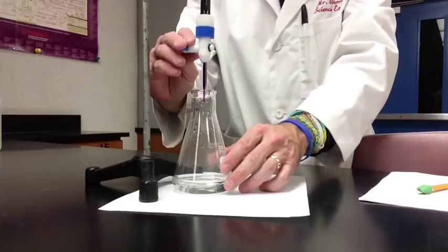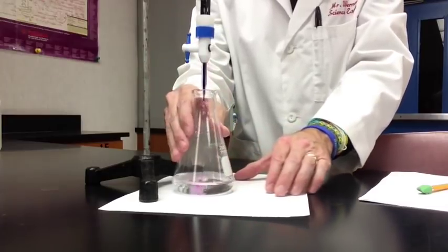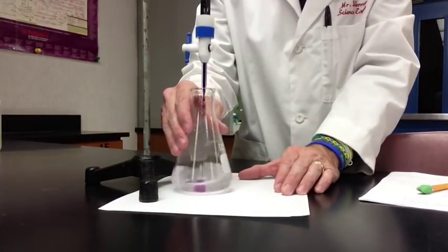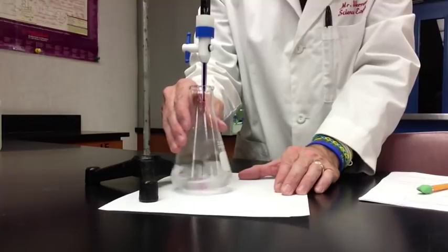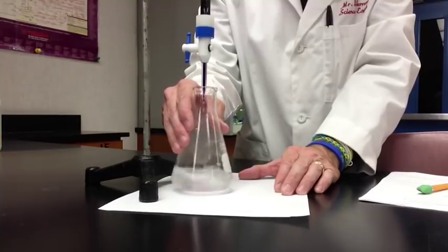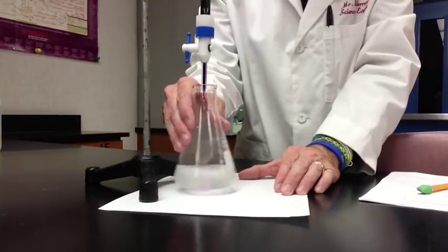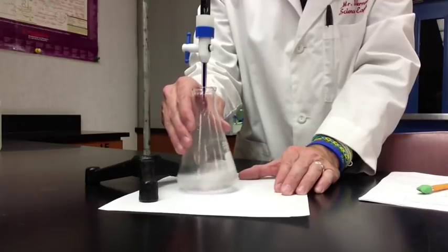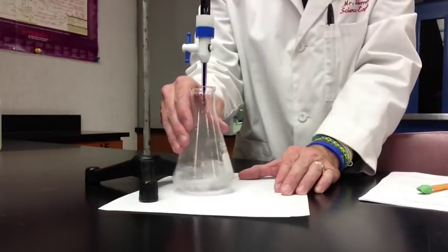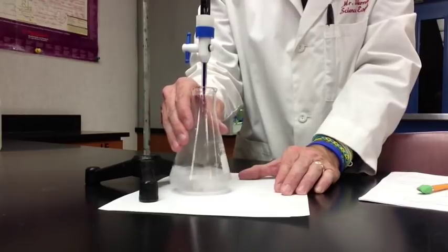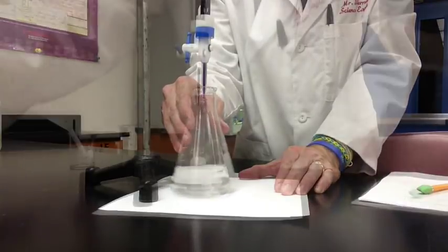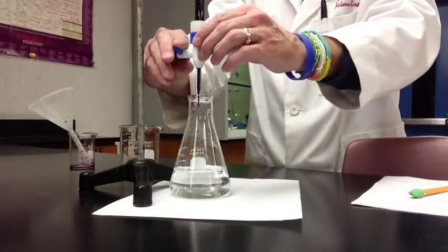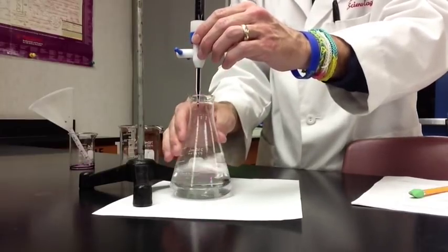Now you could have it already set at whatever measurement. It could be at the zero or whatever your starting measurement is, make sure you record that. Then you open up and you can let it stream for a little while because it's going to take probably 20, 30 maybe more milliliters and you start swirling it. Make observations of what's happening inside the flask as it's coming out. The swirling is a very important part of this.